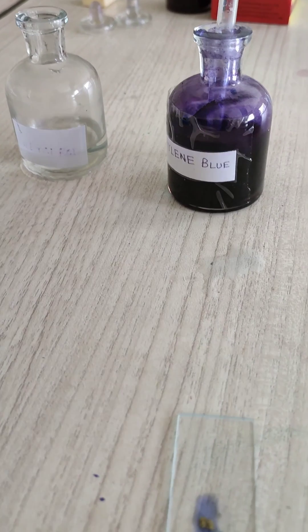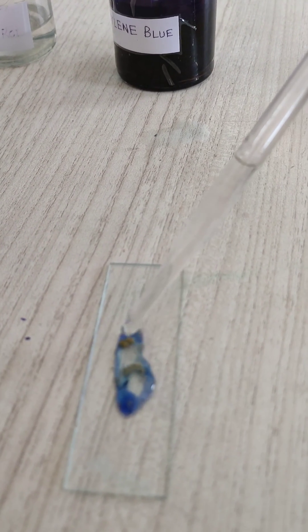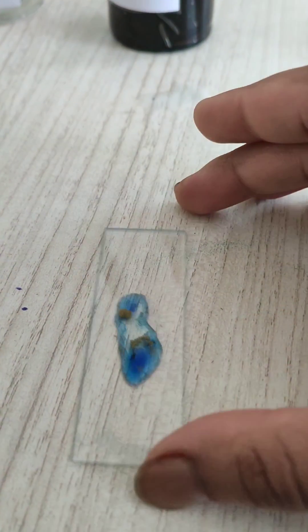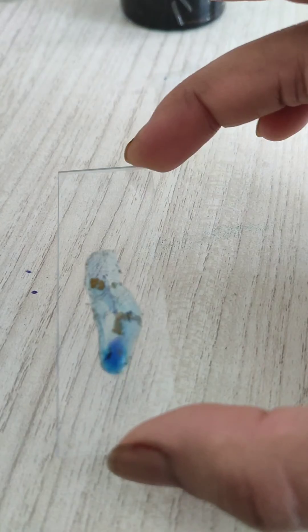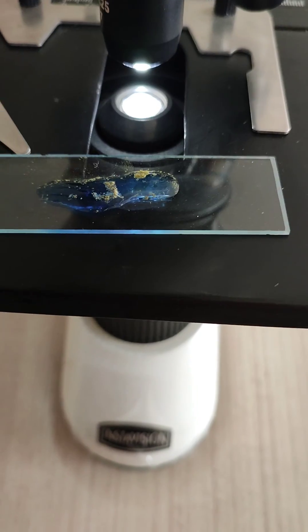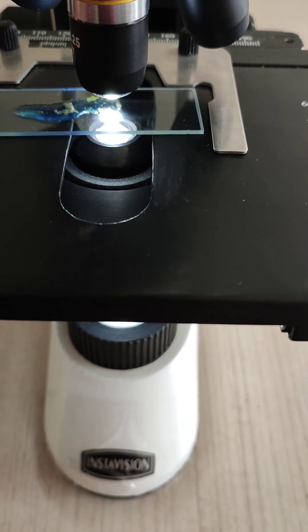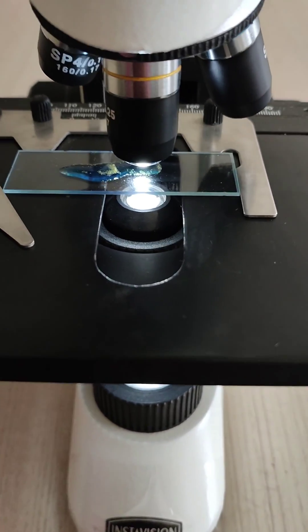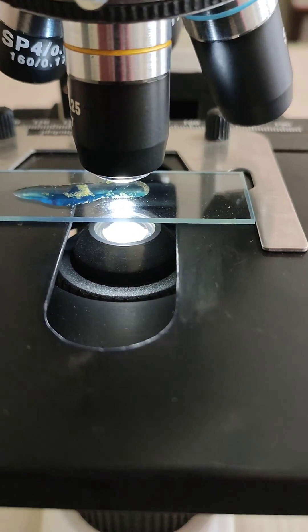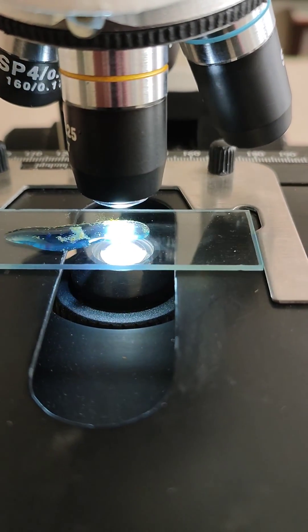Then add 1 to 2 drops of glycerine solution. Now our slide is ready. We observe in the microscope — first at 10x and after that 45x. These are the compound electric microscope. Let's see the microscopic structure of our Rhizopus or bread mould.